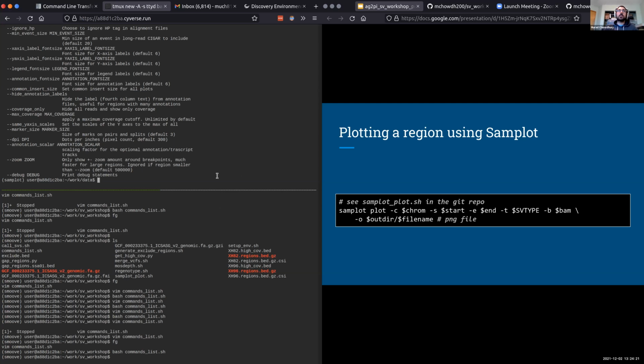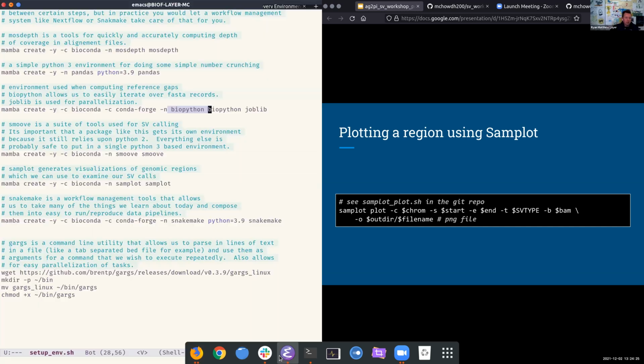In our Git repository, we also made it possible to do multi-sample visualization. For as many BAMs as you include, separated by spaces, it'll add another subplot. If you want hundreds, that's not practical; 10 is about the most you can look at, but it can do multi-sample visualization.